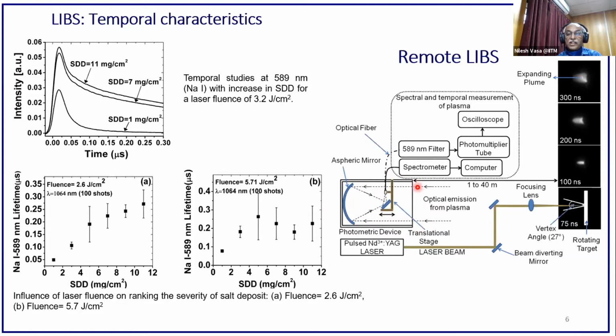But the modification we made here is that the configuration was set in such a way that the plasma optical emission can be captured from varied distances.